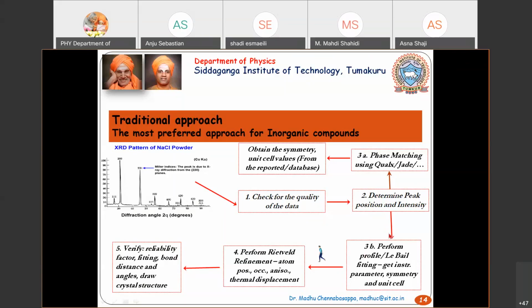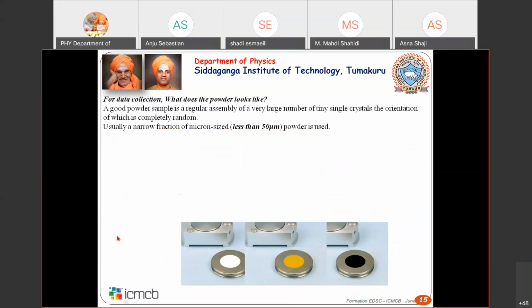This is mainly to do some decarbonation. Okay, so because you have barium carbonate, it has a lot of carbon, so you want to remove that carbon because you are trying to form BaTiO3. Okay, so in that case what happens is, so I will try to write here. Okay, so maybe you are taking barium carbonate, BaCO3. Okay, then you also take some titanium oxide, TiO2, and your main product is you want some barium titanate, BaTiO3.